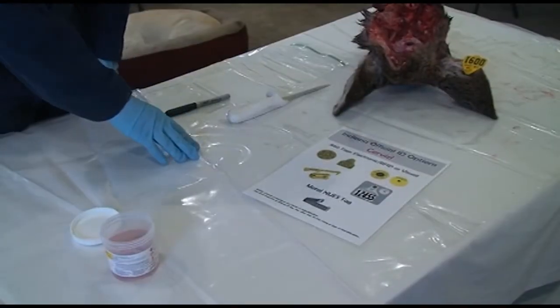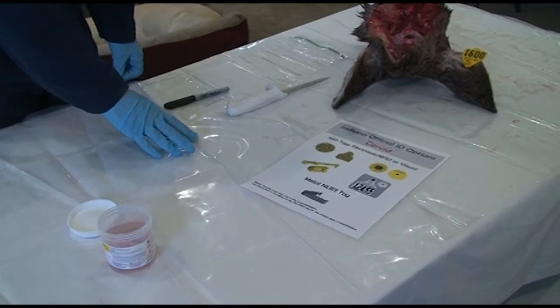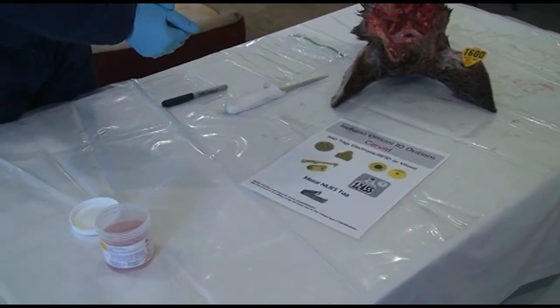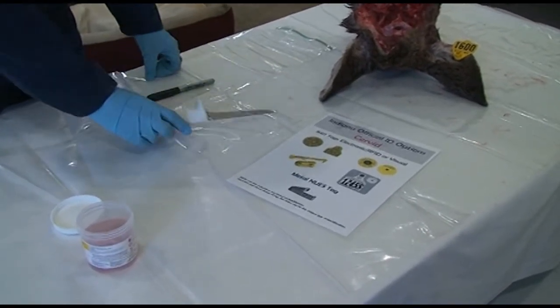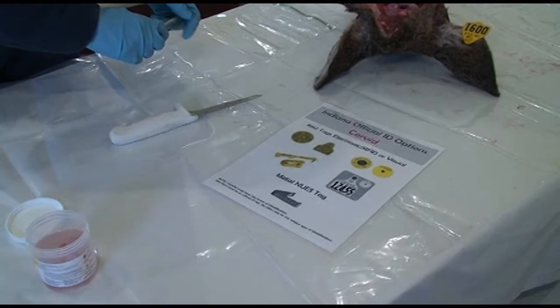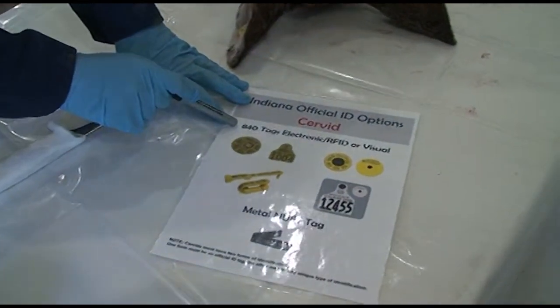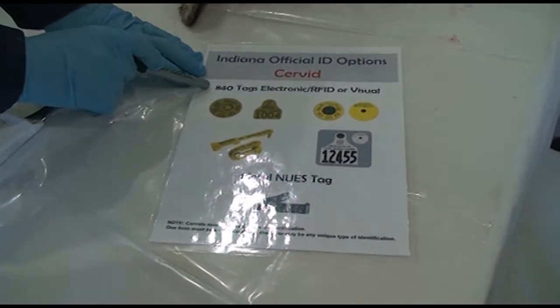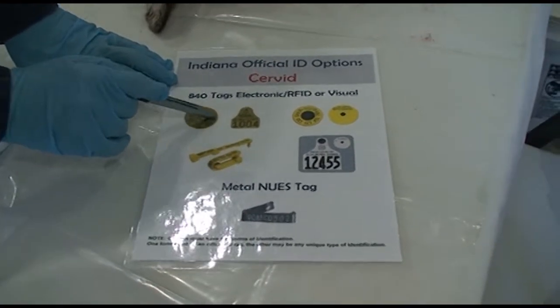Step 5, Official ID Collection. The next thing we're going to talk about is official ID and packaging and getting our samples ready to ship. So the identification that needs to go with the sample needs to be sent with an official ID. Official ID is going to be the ear tags that are a 15-digit tag that starts with 840, which stands for U.S. origin tag, and they've got a 15-digit ID.